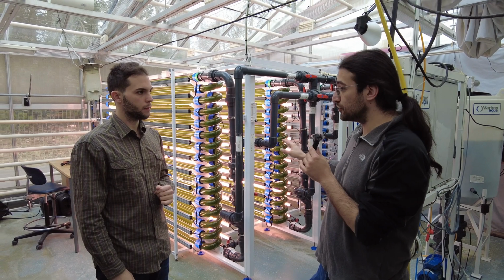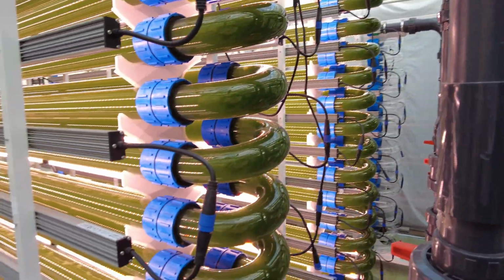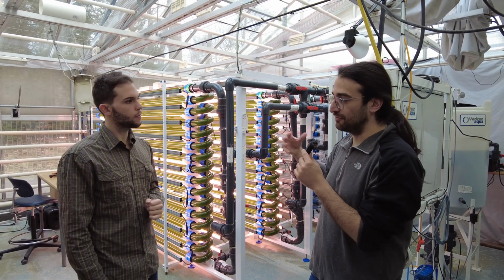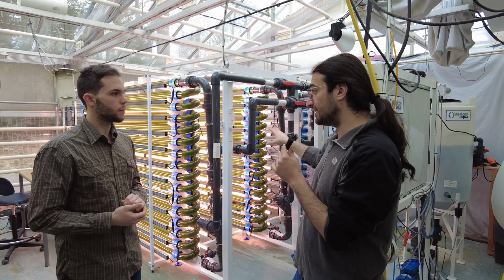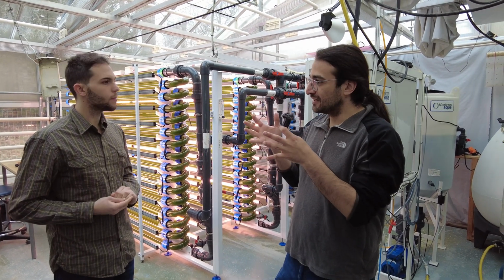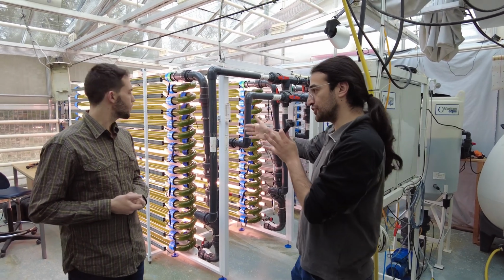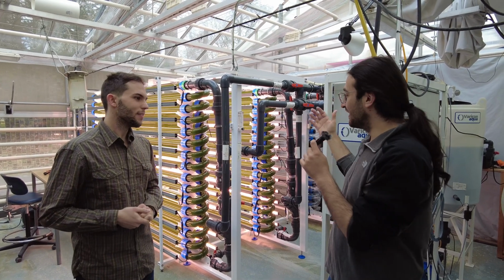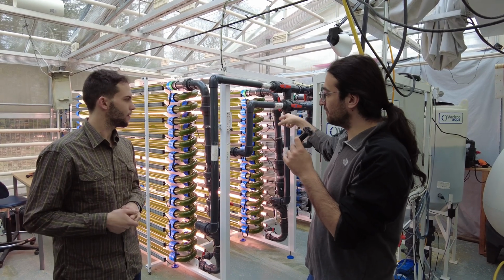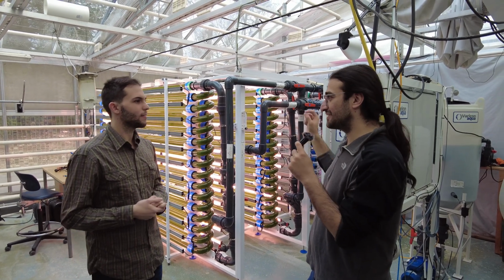So what we are doing is trying to find a way to maximize biomass productivity and nutrient uptake performance of the algae, and our collaborators will use our recipe. So we have a validation plant here. But to inoculate this 1000 liter PBR, you need something like 60 to 150 liters of inoculum. Inoculum means the algae at a dense level. So we can use this smaller version of the PBR, which we showed before. We inoculate our algae with the wastewater in the PBR, and we make them run to make sure that our algae is literally eating everything inside the system while they are growing.